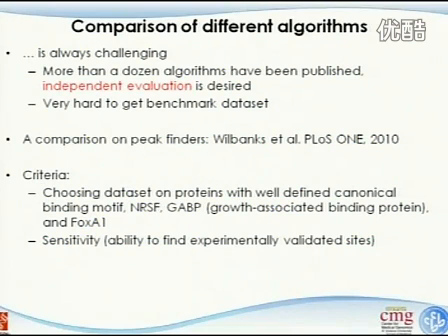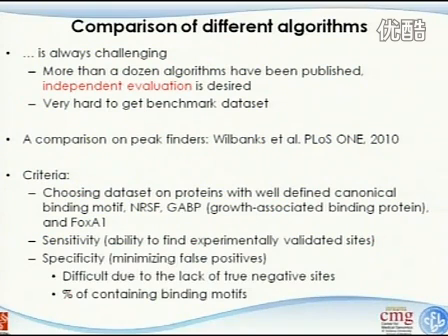The good thing is there are hundreds, sometimes dozens, of validated regions, where people used PCR-type studies and already found hundreds of binding sites. Those are really experimentally validated. So they want to see how sensitive different methods are, meaning what percentage of those binding sites they find.